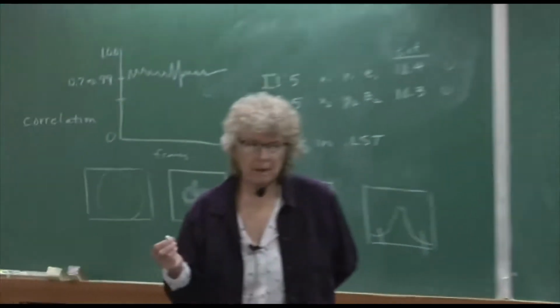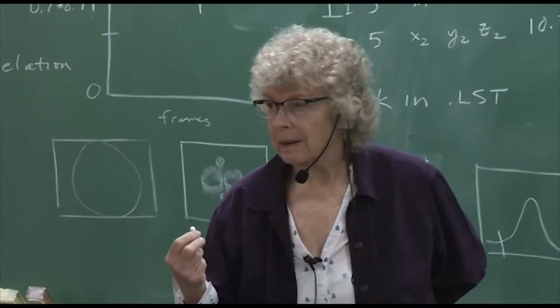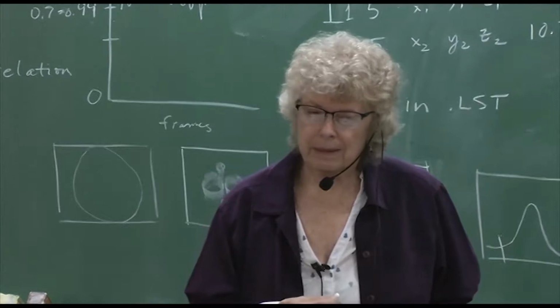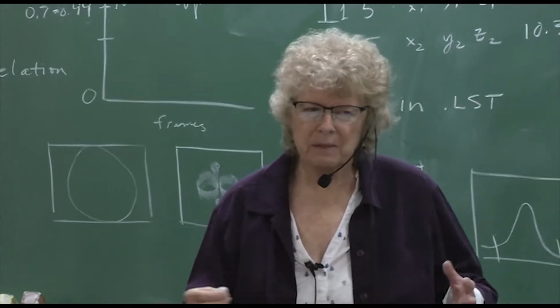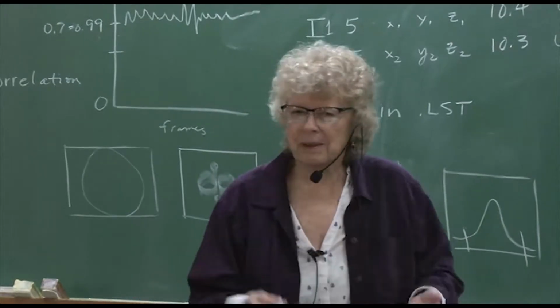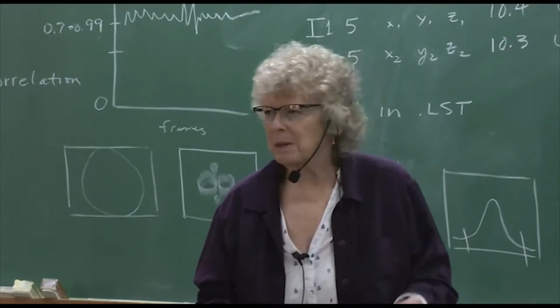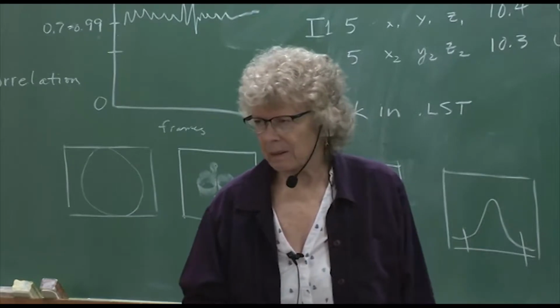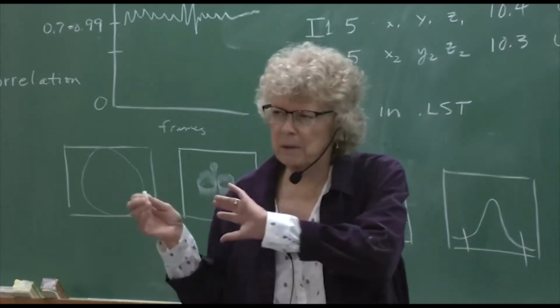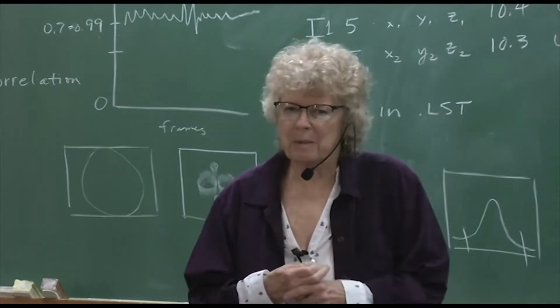And sometimes it comes out to not an even number, but that's okay. It's just what you've done. I mean, sometimes a solvent has evaporated from the crystal, so it's not at 100% occupancy. It's not even at half occupancy. It's something in between or less. Could be 20%, because it's basically just evaporated from a void in the crystal structure, and it's not there anymore.